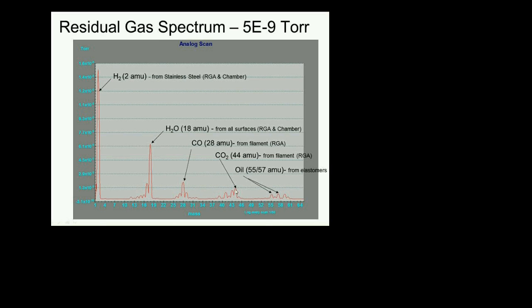I can look at my carbon monoxide and carbon dioxide, get an idea if the filament is doing okay, and I already know I'm at UHV condition.